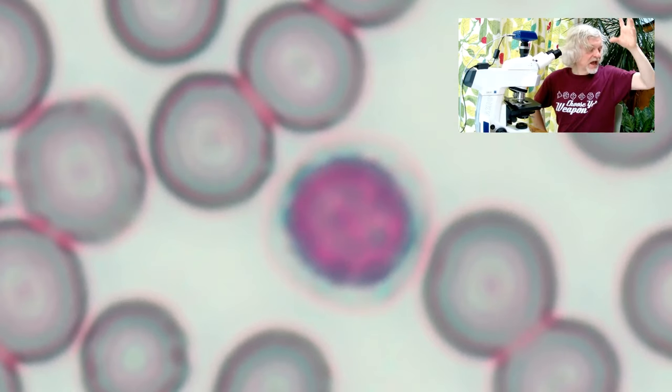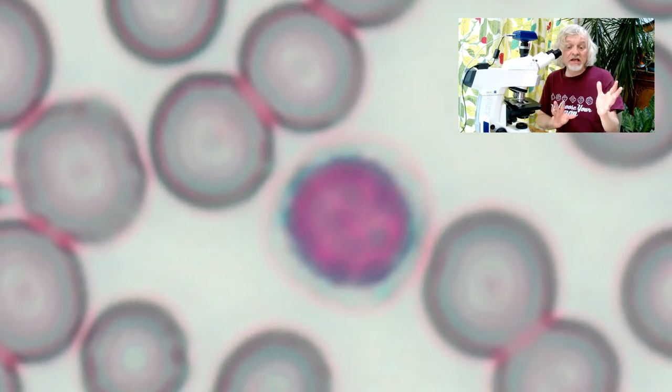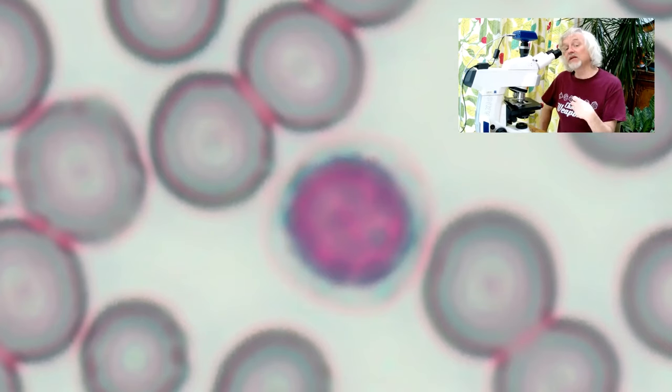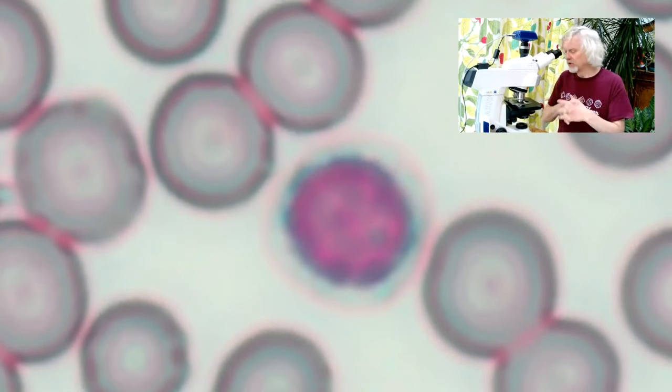This is a lymphocyte. This is one of the types of white blood cells. You have various different types. This type is either a T cell, which is a sort of general organizer for the immune system, because it helps run your immune system. Obviously at the moment, with COVID-19 going around, we're very keen to have lots of these. Then there are some that produce antibodies. Those are called B cells, B cell lymphocytes. And there are also ones called natural killer cells, and they kill cells that are infected with viruses. So obviously we need a lot of those at the moment.